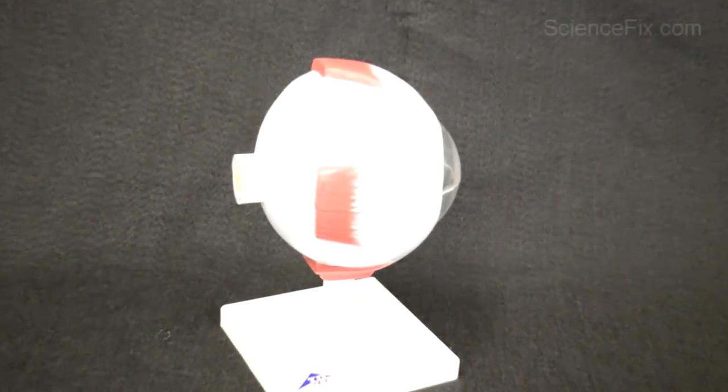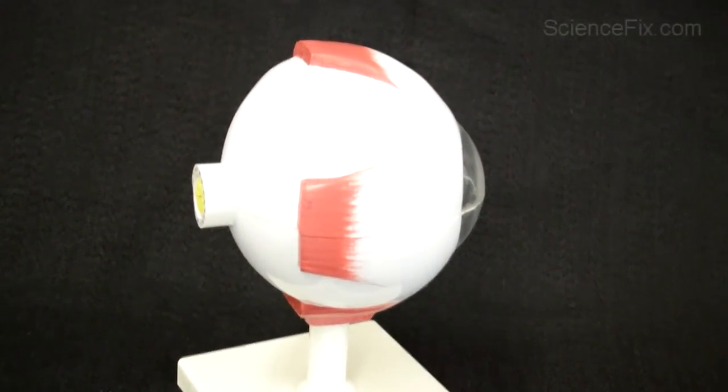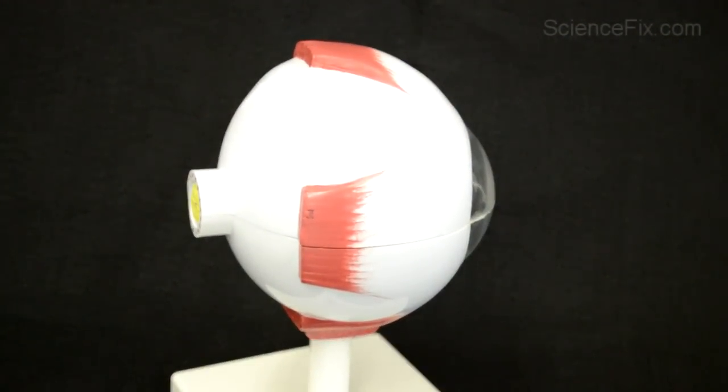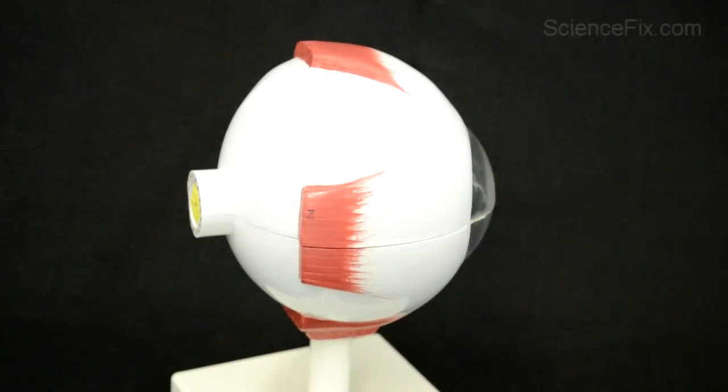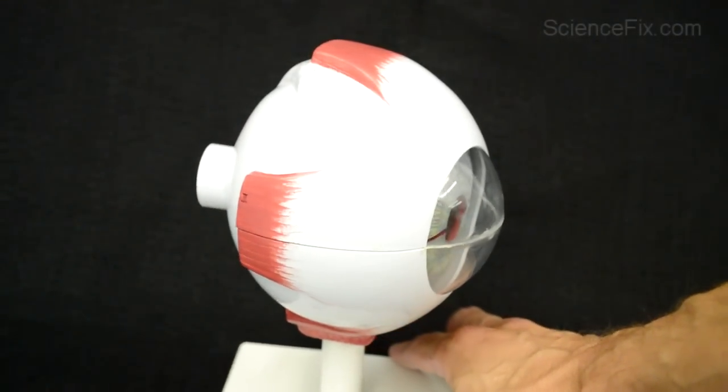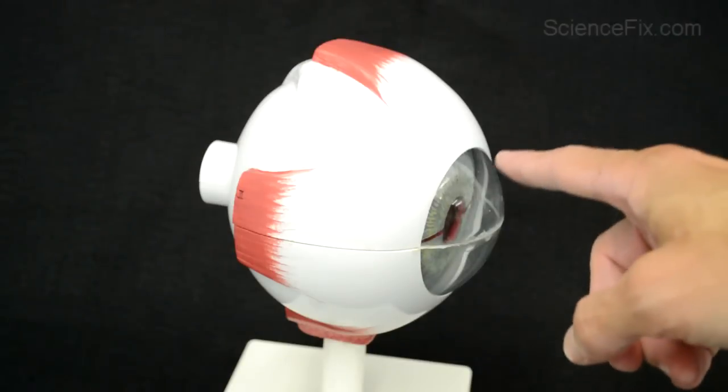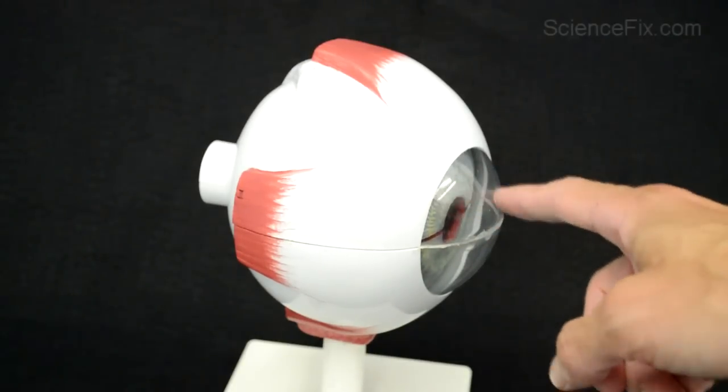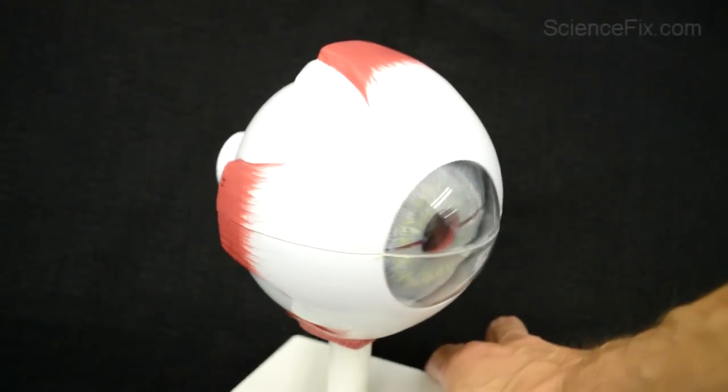So here's a model of an eyeball just to show you that this is the exposed eyeball, and goggles would protect and cover completely the whole eyeball, including the cornea. So if there is some kind of chemical spill during a lab activity, you don't want that cornea of the eyeball to be exposed.